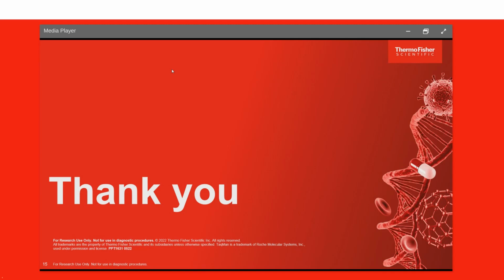Our first question is, can I receive the primer and probe sequences of an off-the-shelf TaqMan assay for submission to a regulatory agency?